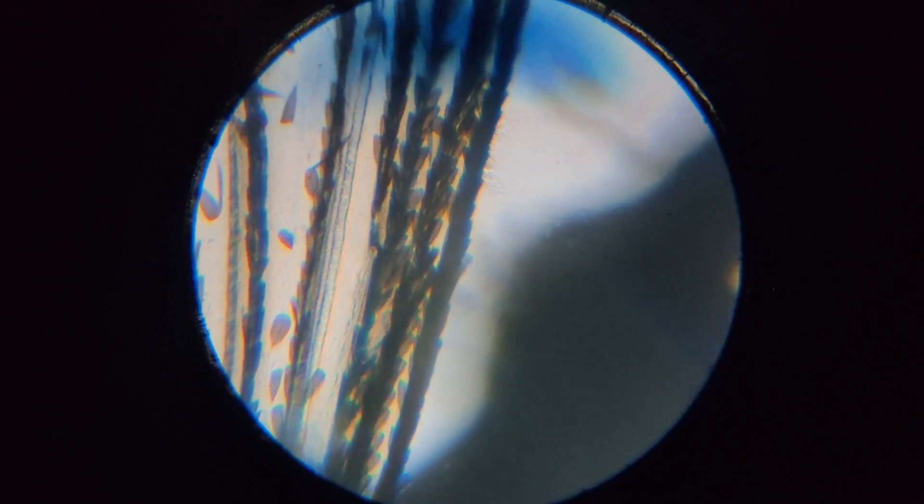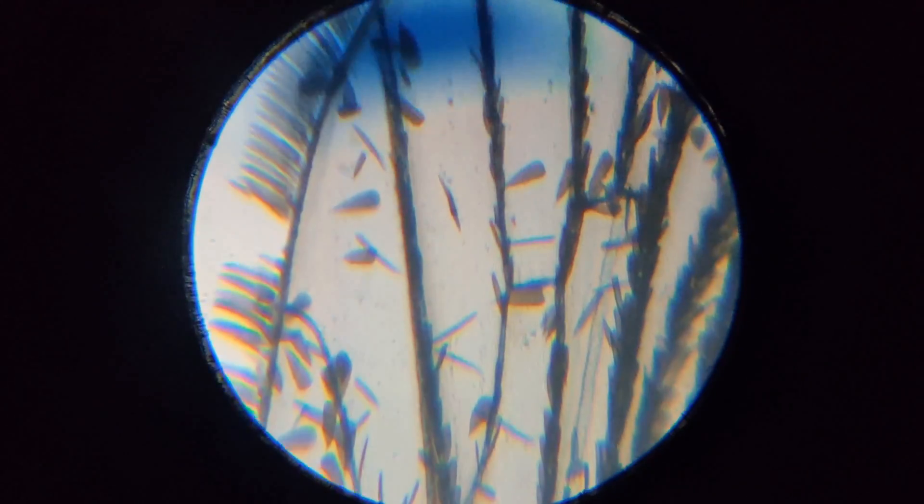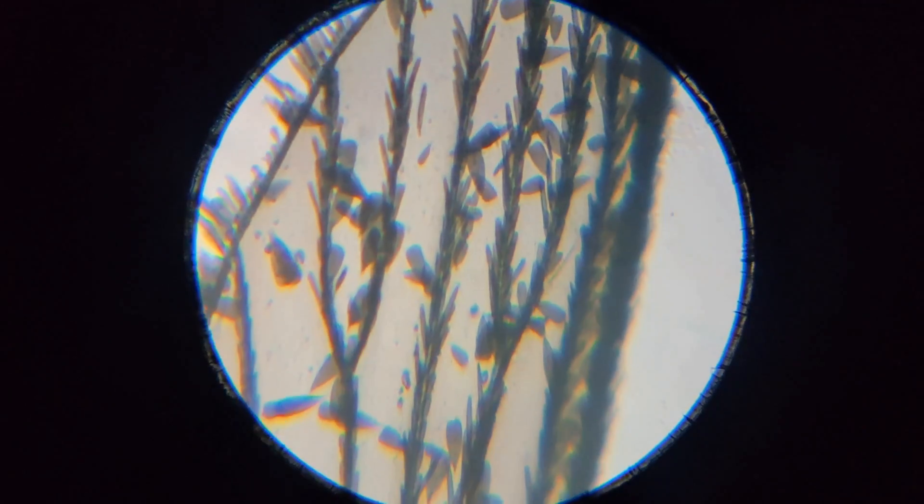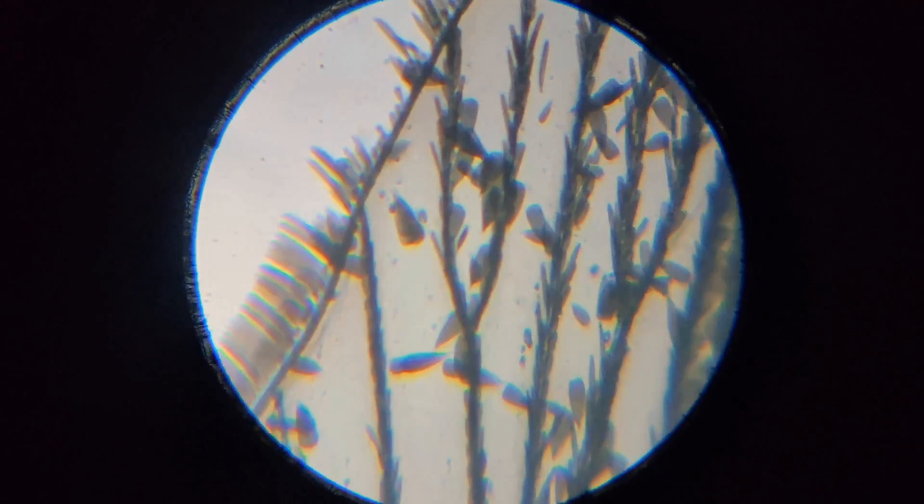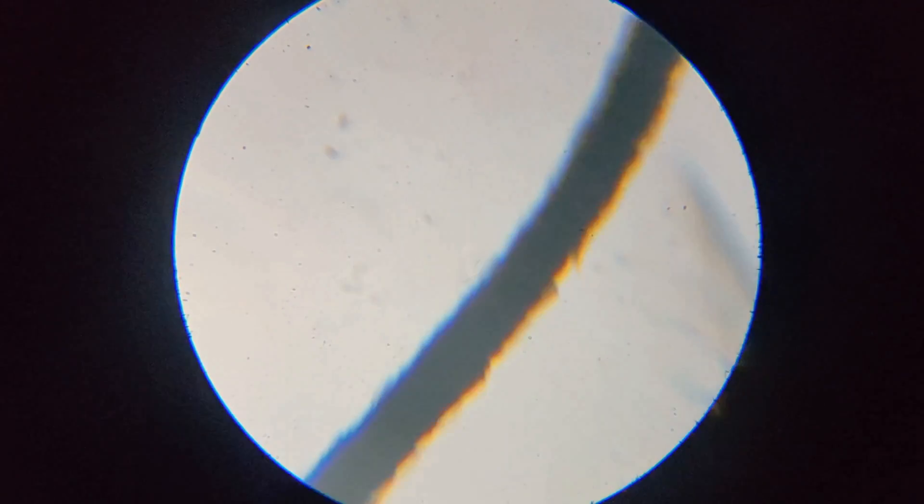Whoa, it's terrifying! Look at its wings - looks very dangerous. I didn't expect this. It also has little feathers. Oh my god, this is the most hated musical instrument in this world - mosquito wings. This is the blood-sucking needle. I thought it would be smooth.